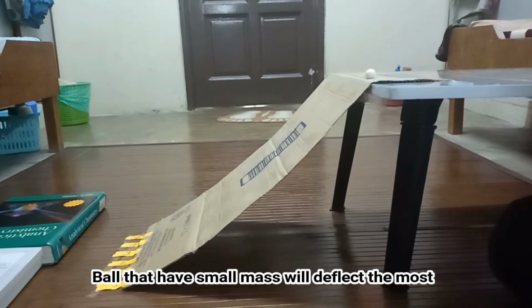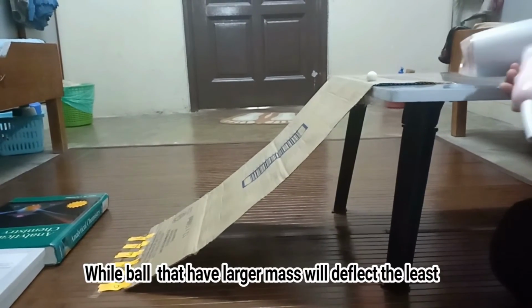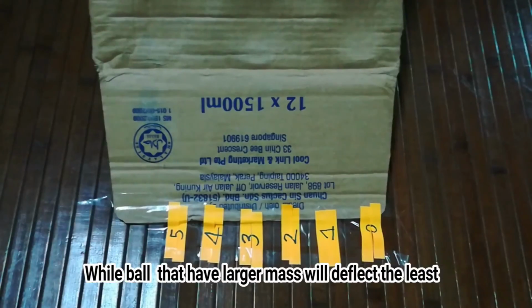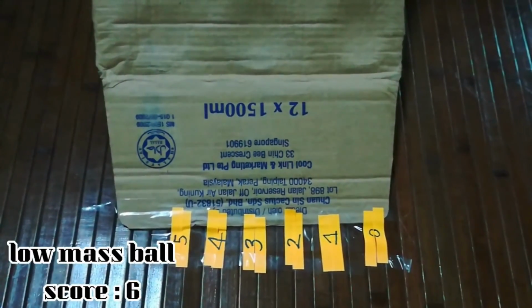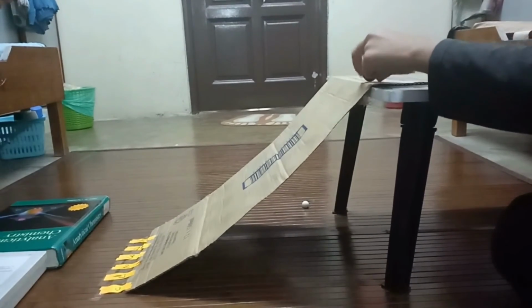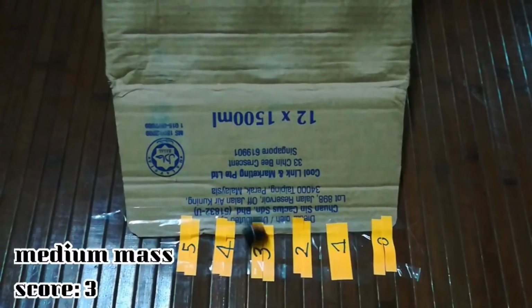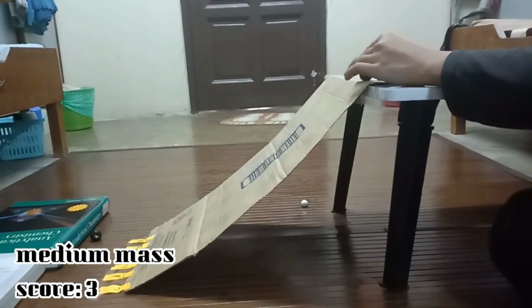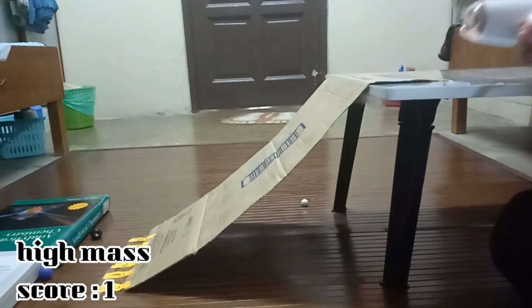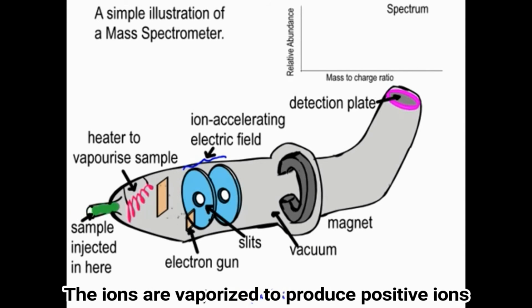Balls that have small mass will deflect the most, while balls that have larger mass will deflect the least. When the sample is injected, it is vaporized to produce positive ions.